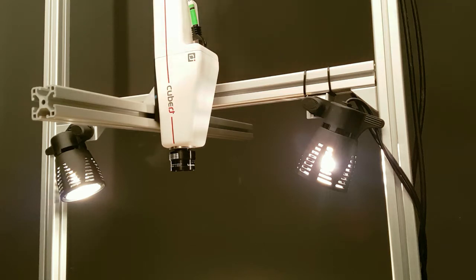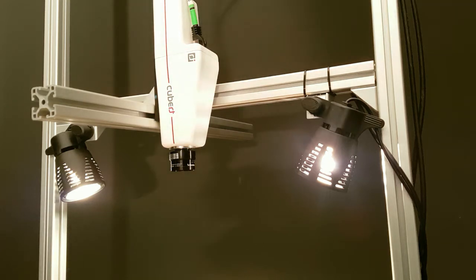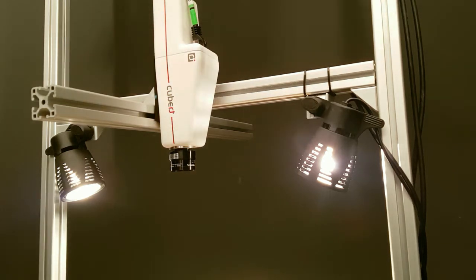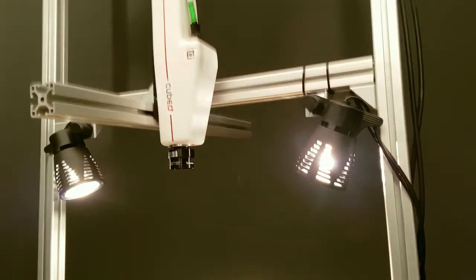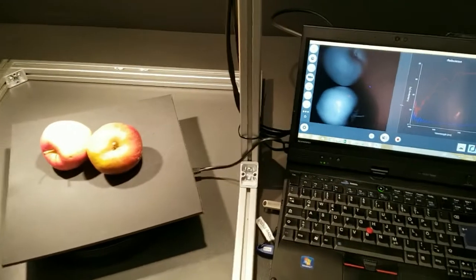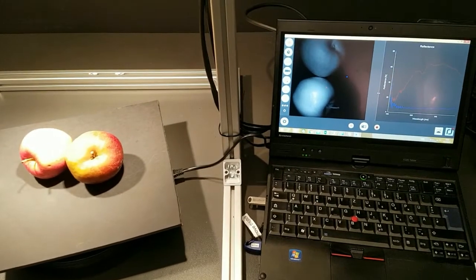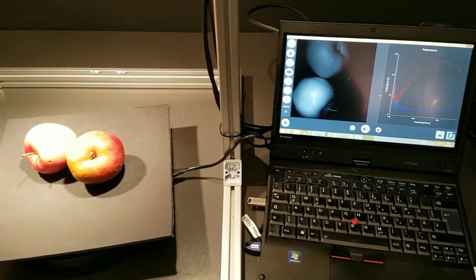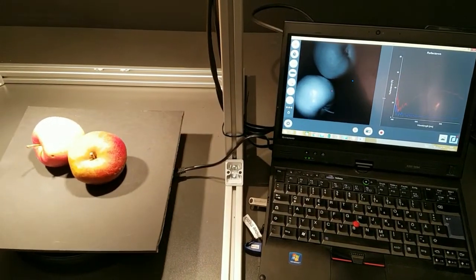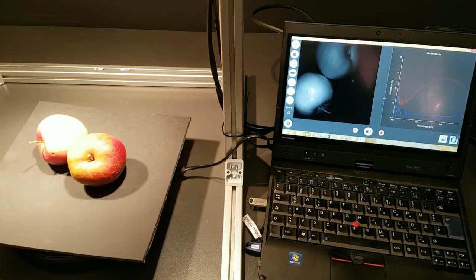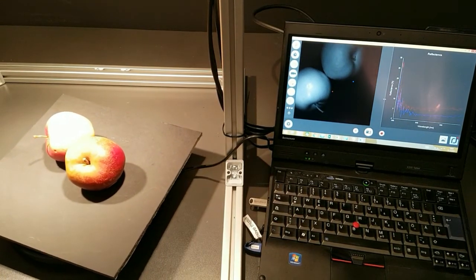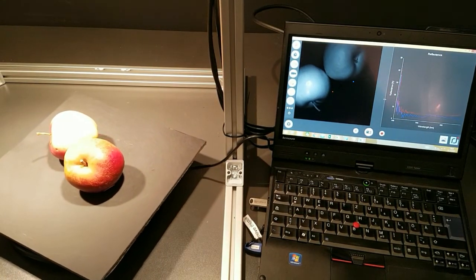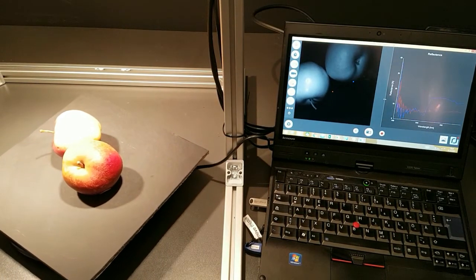Today I want to tell you something about machine learning. What we have here is one hyperspectral camera at the top. We have our small measurement setup. We want to show you how to teach a camera to distinguish these two apples.